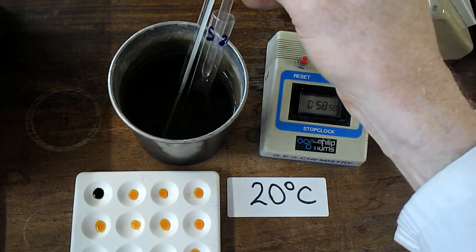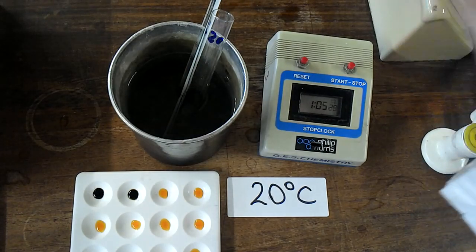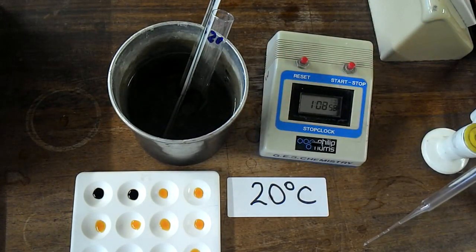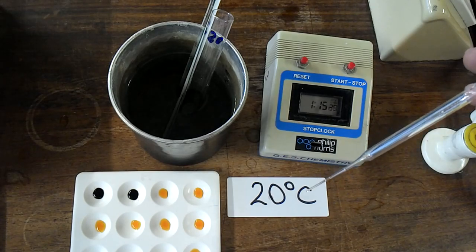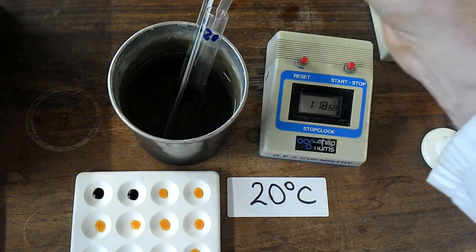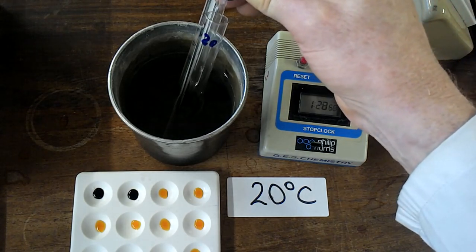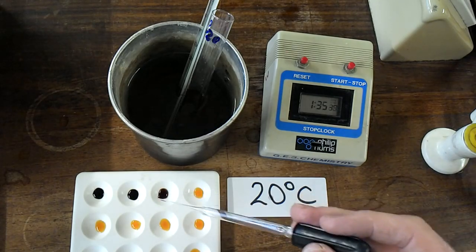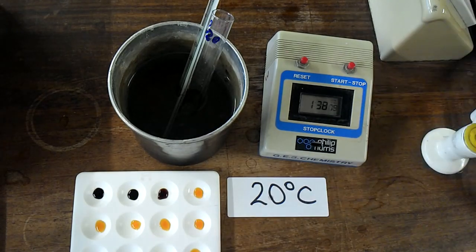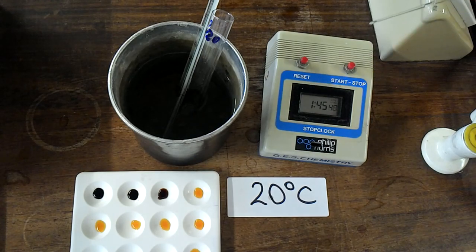So in fact, my time is coming up for a minute already. So that's one there. And back into the pot again. The tube should remain in the water. So just wait for it to come around to 1.5 minutes. There we go, and in it goes, 1.5 minutes. And you probably notice here it's already starting to be less brown. We'll try again. Make sure you return your solution back to the stock each time.